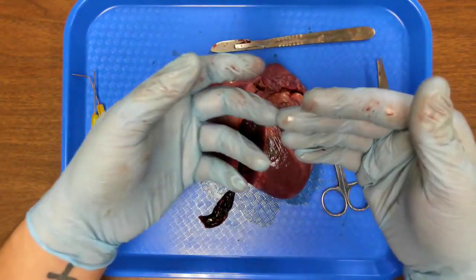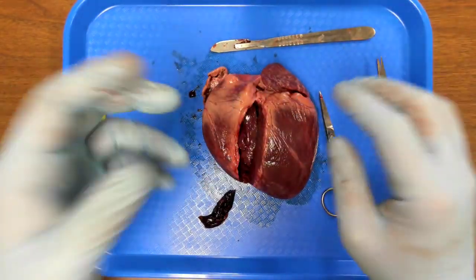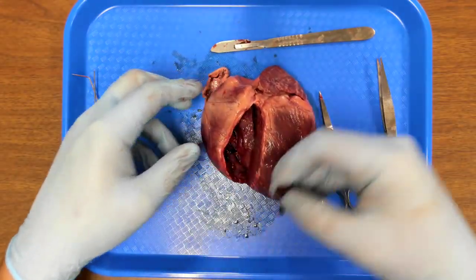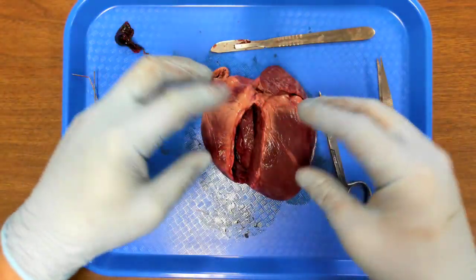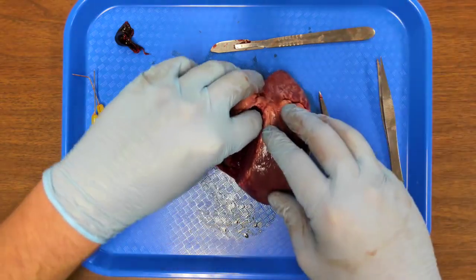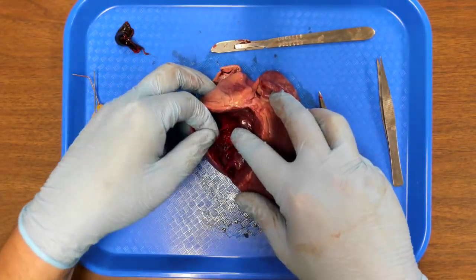Well, when this animal died, its natural response was to clot that blood so that it would stop bleeding. Now, unfortunately, some of that blood clotted or stopped inside the heart. And it's very sticky. Okay? So we might see some of that inside of this heart because this is not a preserved specimen. It wasn't dipped in chemicals or anything. This came right from someone who had a pig, and the pig died.